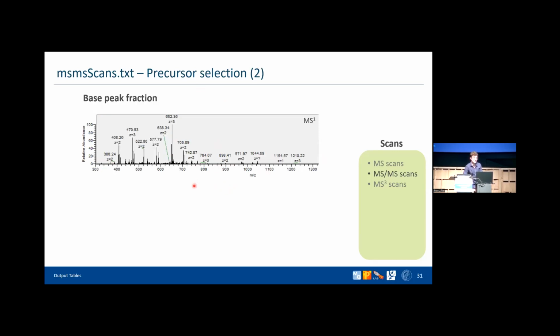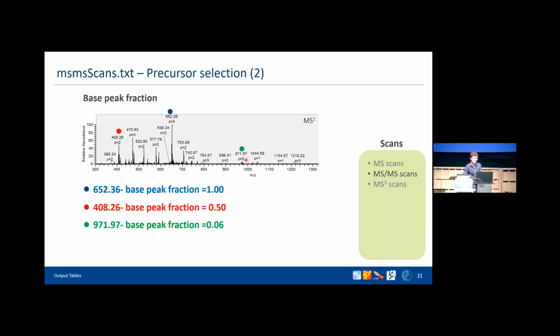And you can do this in retention time. You can, of course, also do this in mass over charge. So that's basically the same. You look at the highest peak, and the question is, if you do data dependent proteomics, which peaks should I select? Relative to the highest one, should I select only a very stringent cutoff, so only if it's like 50% of this highest peak, or maybe very low.